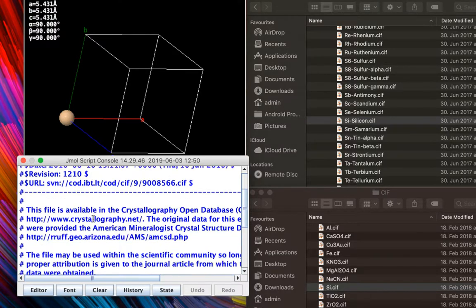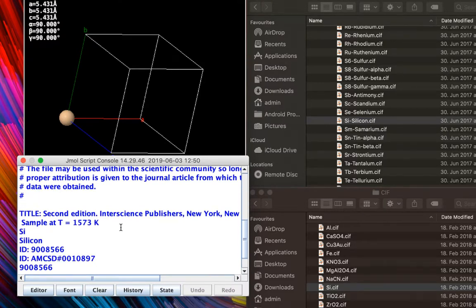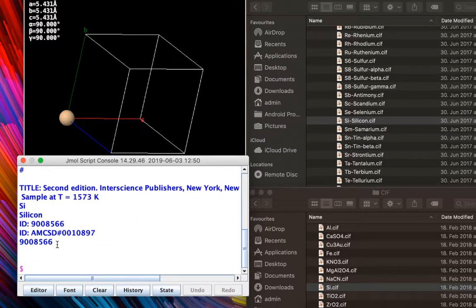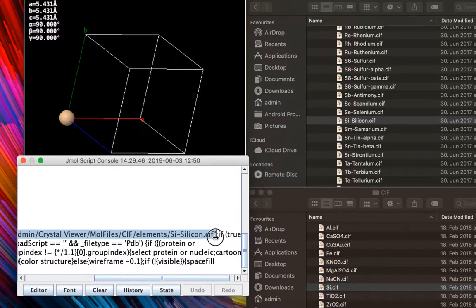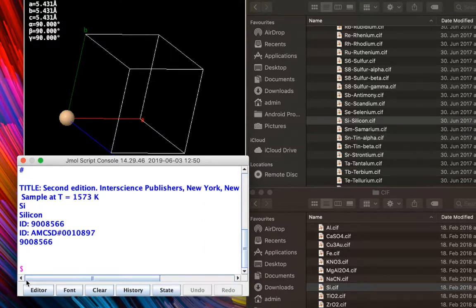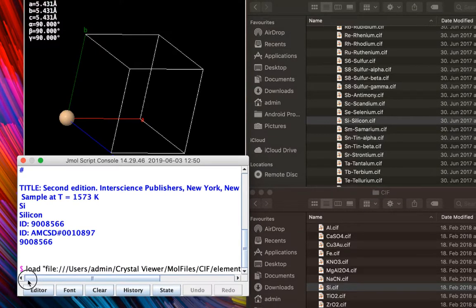If you look at the console you'll notice there's a lot of output, which is basically read from the CIF file — specifically the comments within the CIF file. Just go ahead and come to the console and press the up arrow key on your keyboard to load up the previous command, much like the terminals on Linux or Windows. In the previous command you can see the path of the file used to visualize it. Go ahead and copy the whole path including the double quotes, then press the down arrow key to clear that previous command, and type in `load` followed by the path of the .cif file you copied.